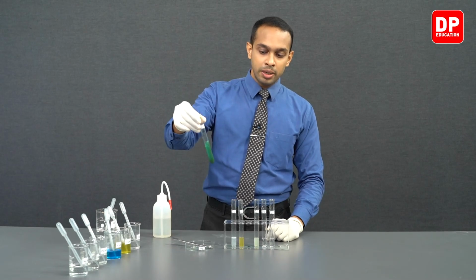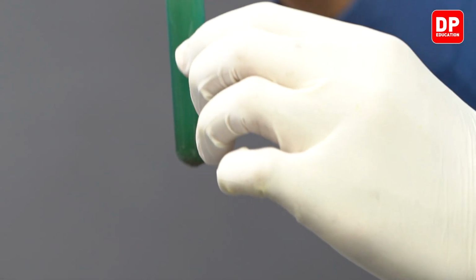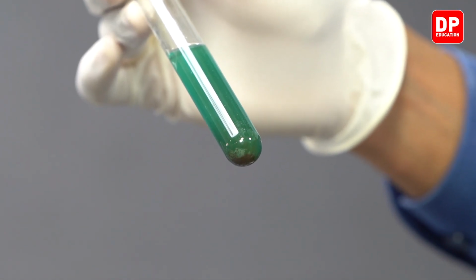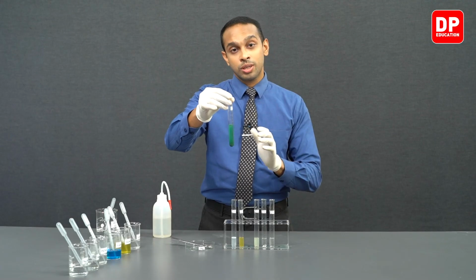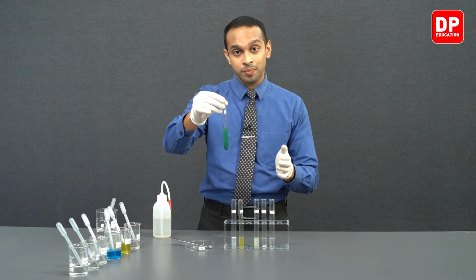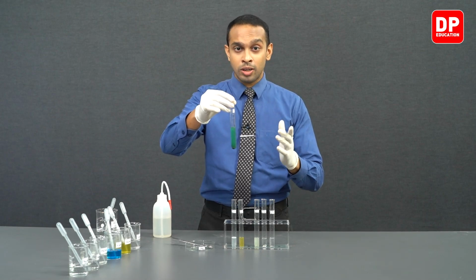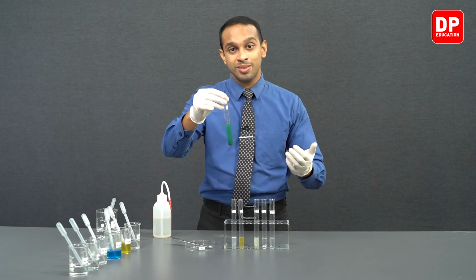And the copper metal that is formed, tiny particles of copper metal, is dispersed in the aqueous medium over here, and the majority of the copper metal is at the bottom of the test tube. So you can observe this brown color precipitate very clearly after diluting the solution. So the copper 2+ ions in the medium have gotten displaced by magnesium. Magnesium will get oxidized to form magnesium 2+, while copper 2+ ion will get reduced to form copper solid, or copper metal.